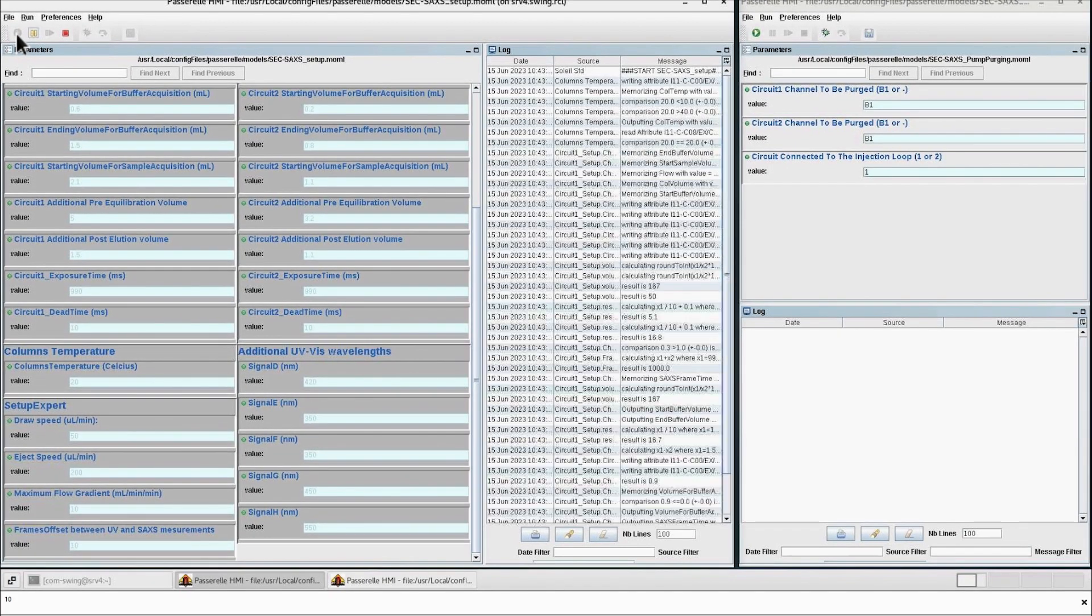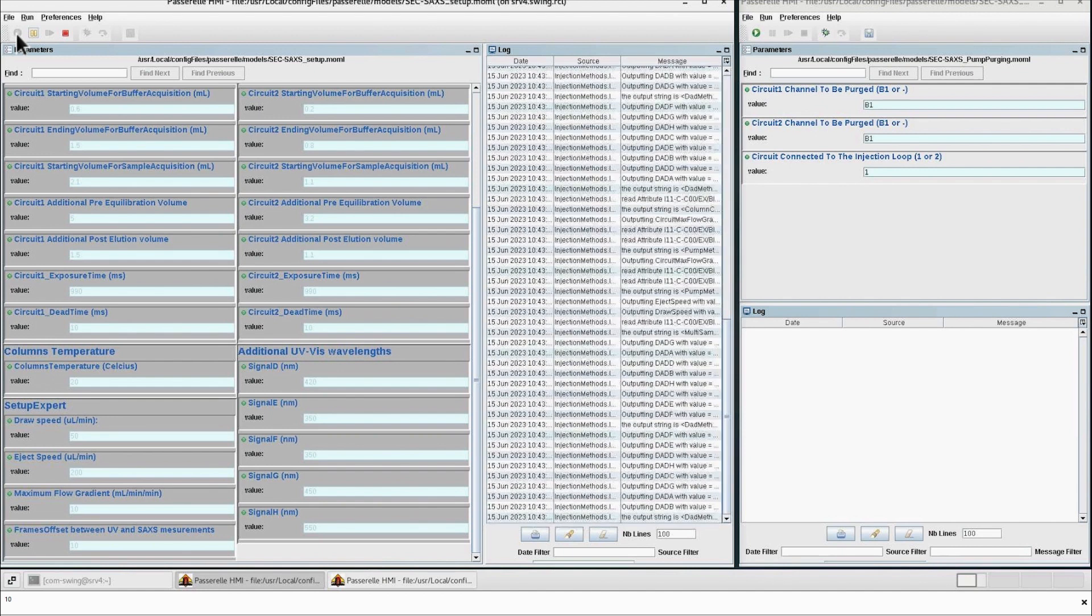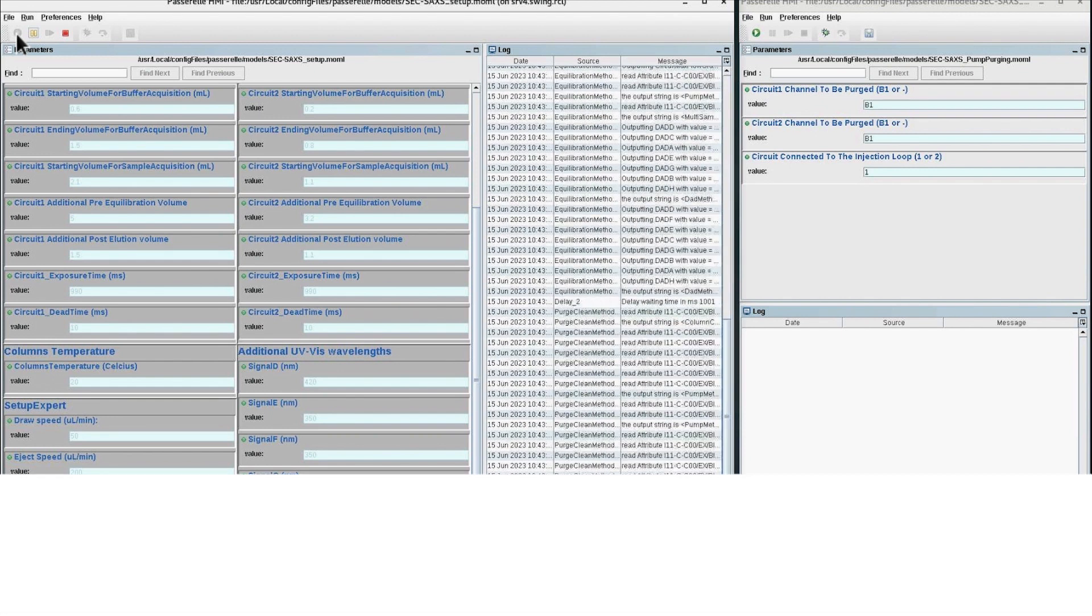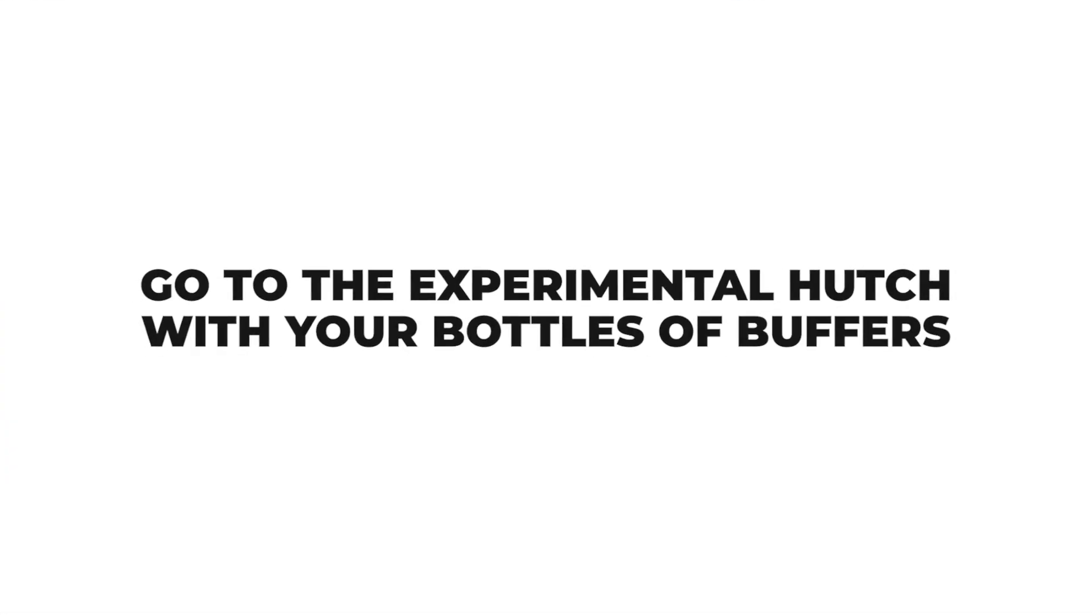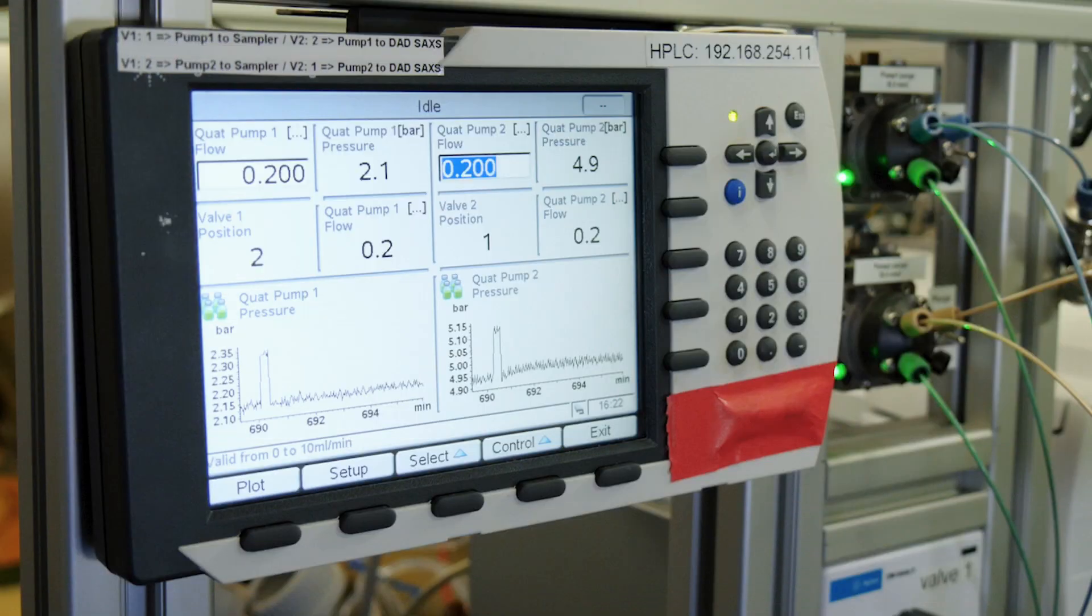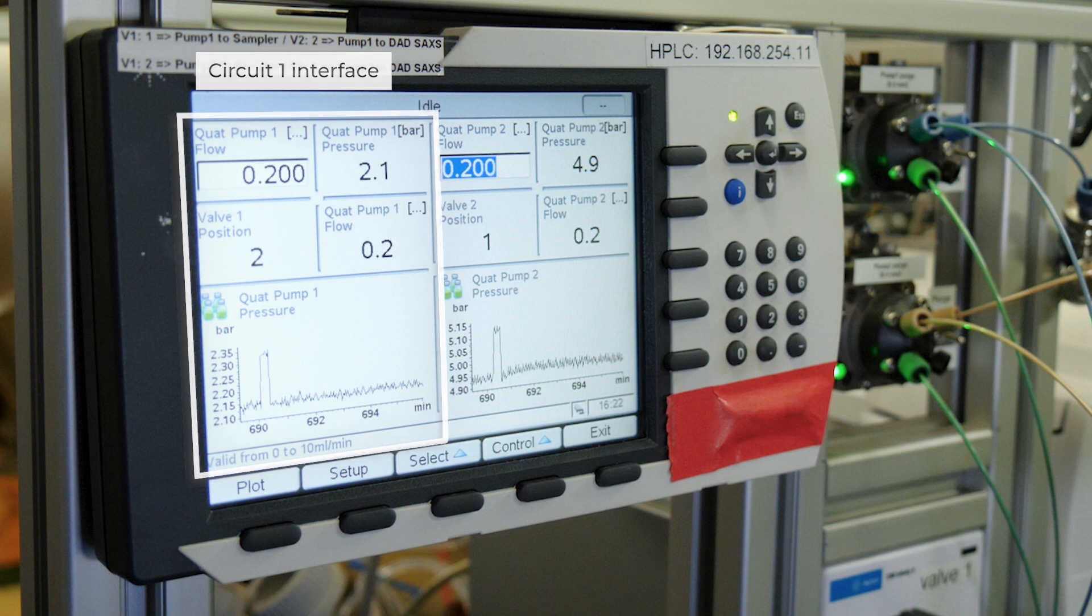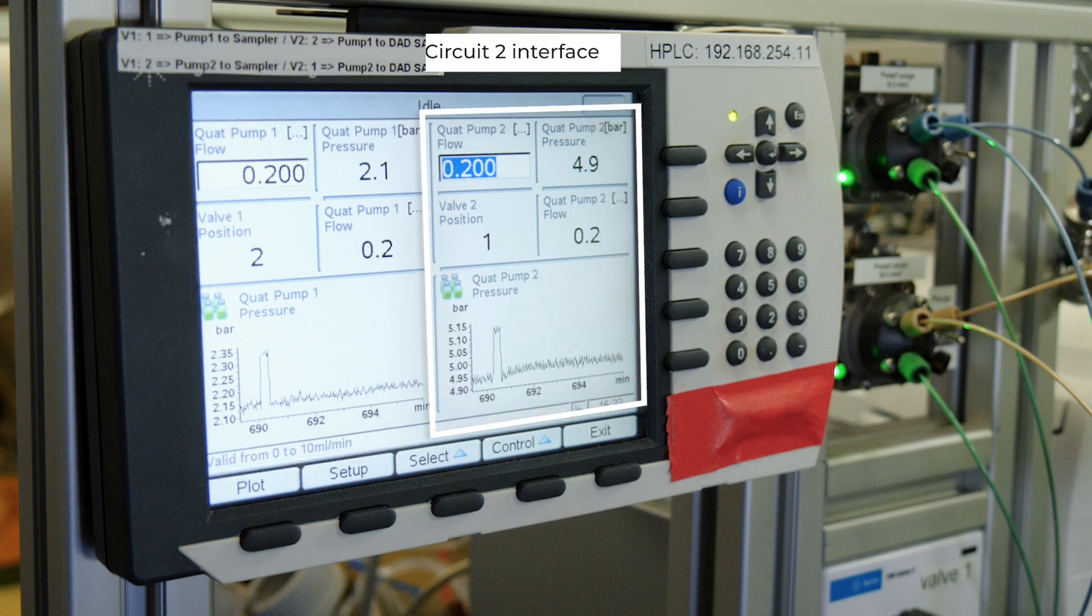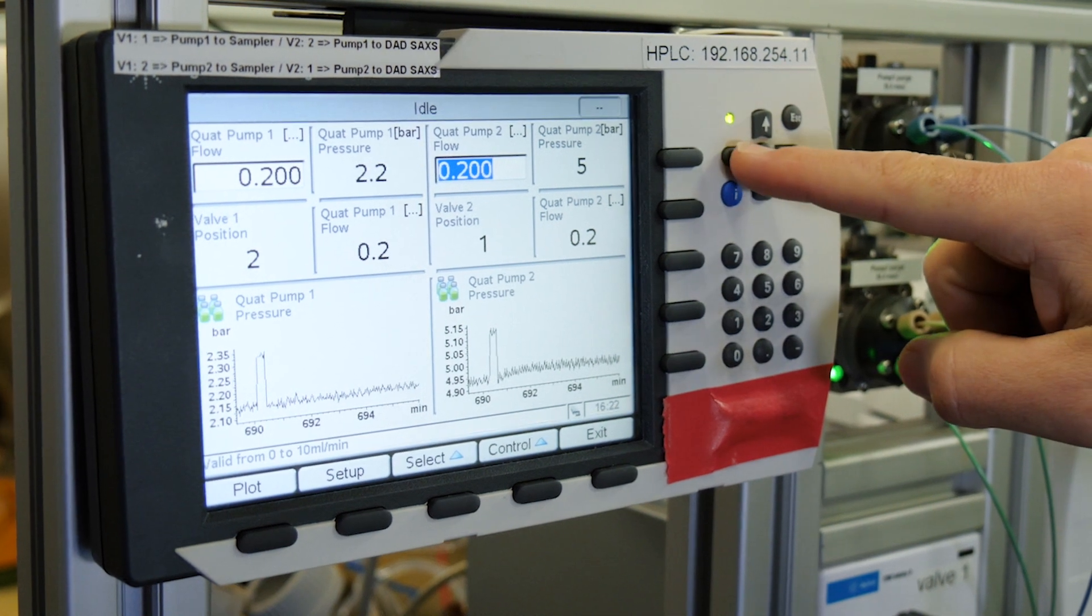This will save the parameters in a database. After ensuring that the x-ray shutter is closed inside the experimental hutch, on the Agilent HPLC panel set the flow to zero on the two circuits.